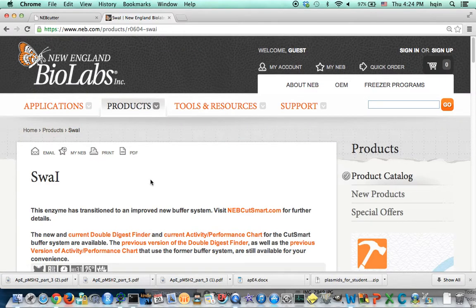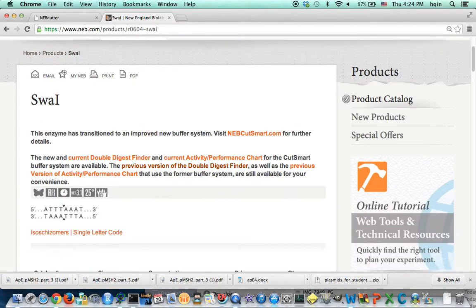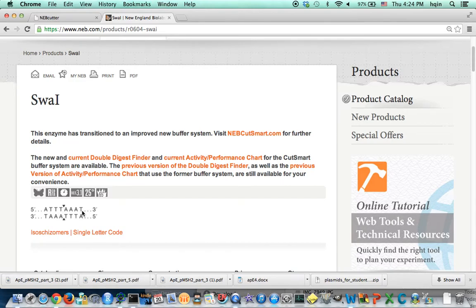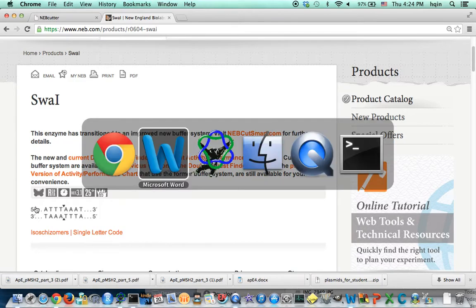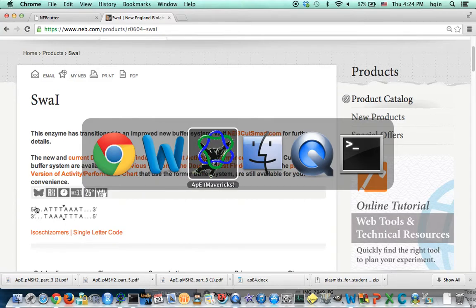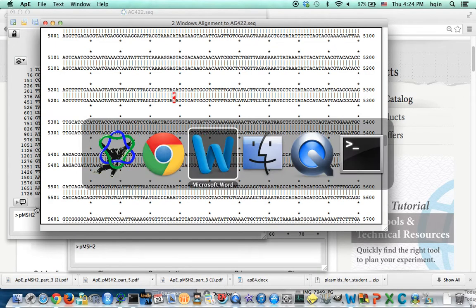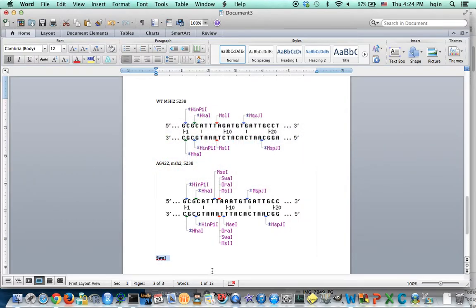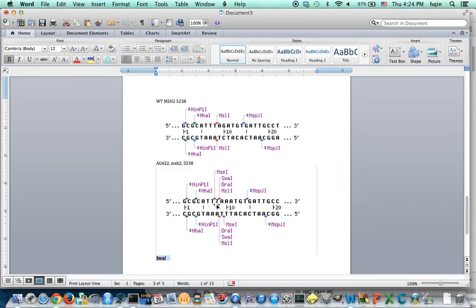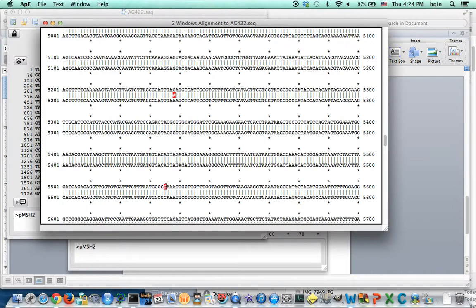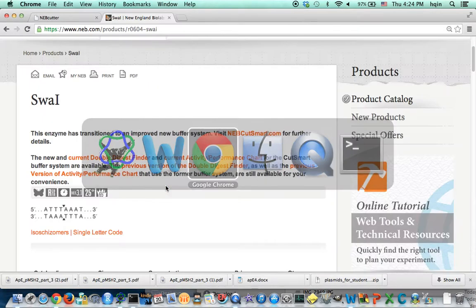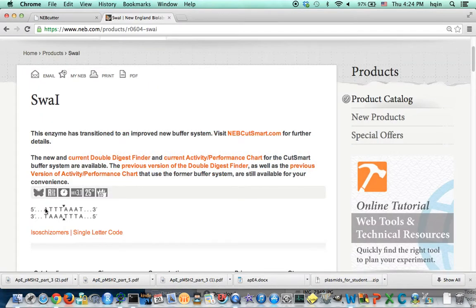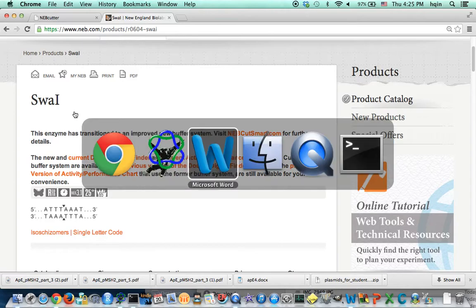And what does this enzyme look like? And then look for ATTTAAAT. So we can go back to SwaI should be ATTT AAAT. Yes, so this is SwaI site.